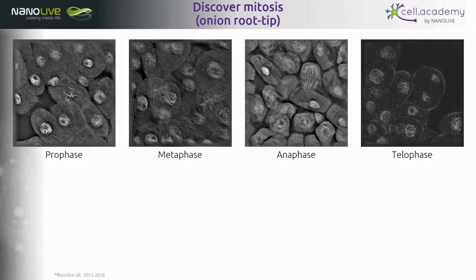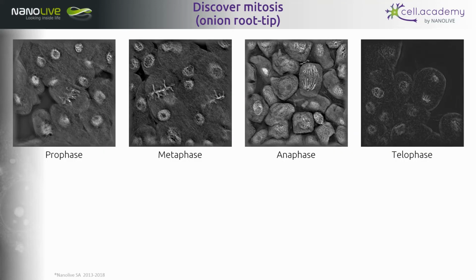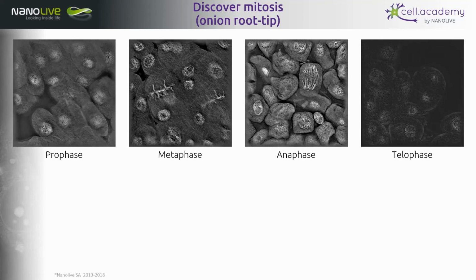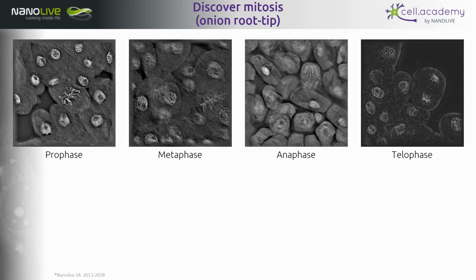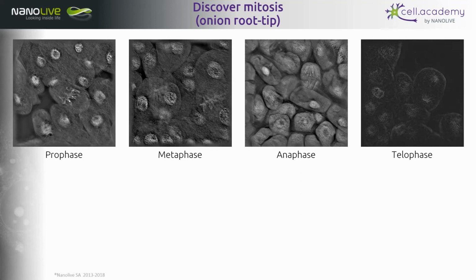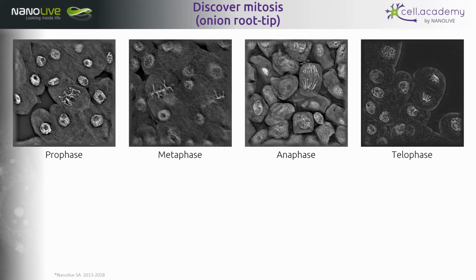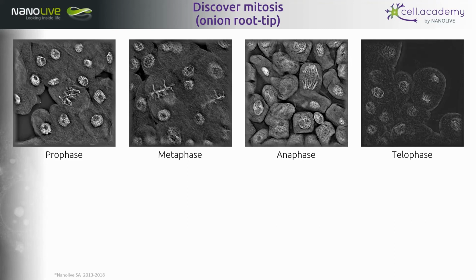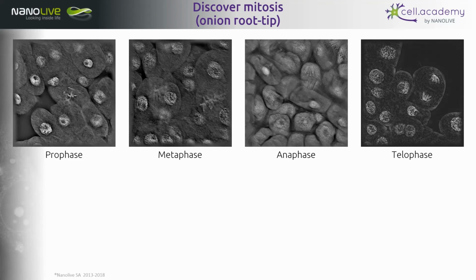So let's take the mitosis lesson package, for example. As you can see, we have multiple raw data files, which are in grayscale. These are the files that the students will be working with. We have different stages of mitosis, prophase, metaphase, anaphase, and telophase, and we can travel through the different stacks of images to then focus on different planes.